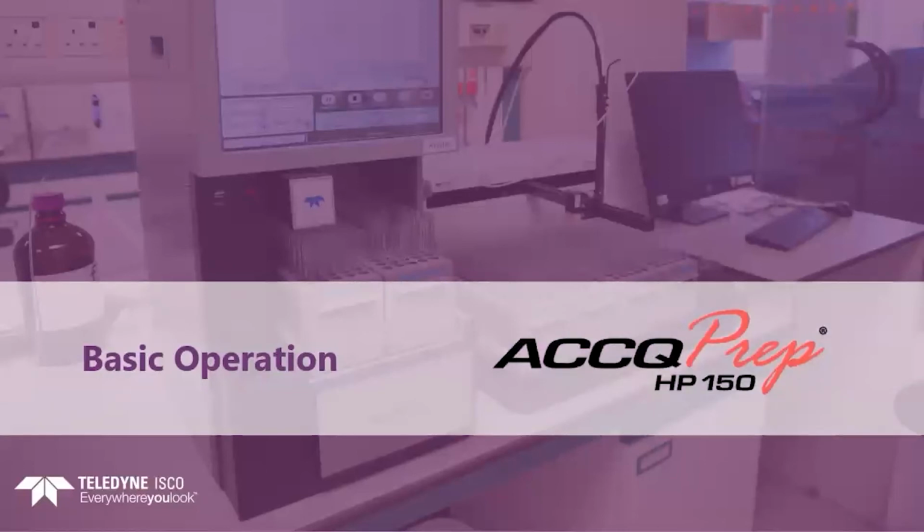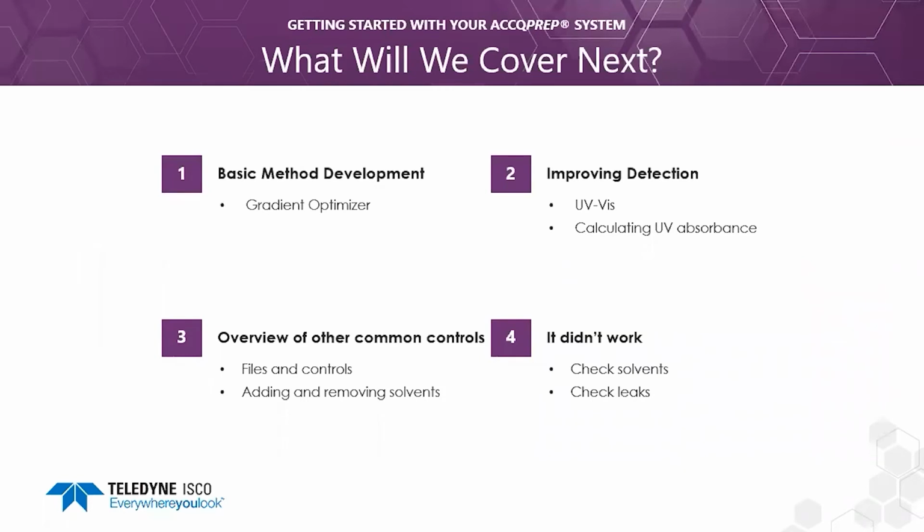Now that we are done with a quick start and we have covered injection options, let's do something more advanced. We will discuss the gradient optimizer and how to use it. We'll talk about how to improve UV detection by selecting a wavelength absorbed by the sample, and discuss how to access old runs and adding new solvents that aren't in the sample list.